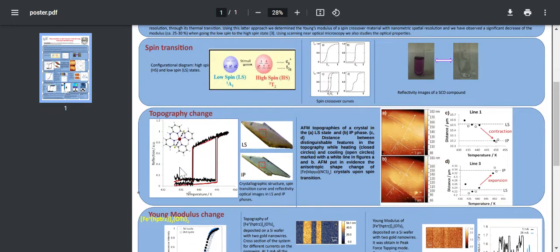So we used this sample that is iron pyridine, and here I show the reflection as a function of the temperature. This sample has an abrupt transition from the low spin state to an intermediate state and has a wide hysteresis. This is high temperatures. And this is an intermediate phase because here we don't have a flat surface, it still increases until the material degrades. Actually, it never gets to the high spin state. And we know this because we made Raman on the sample.